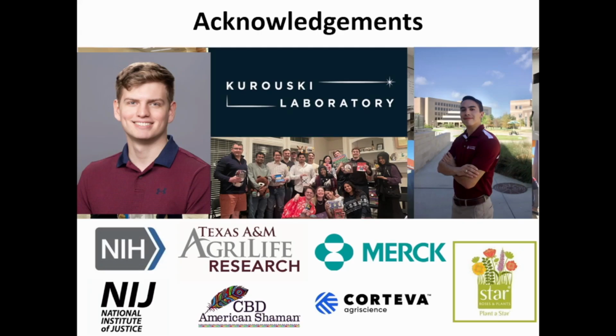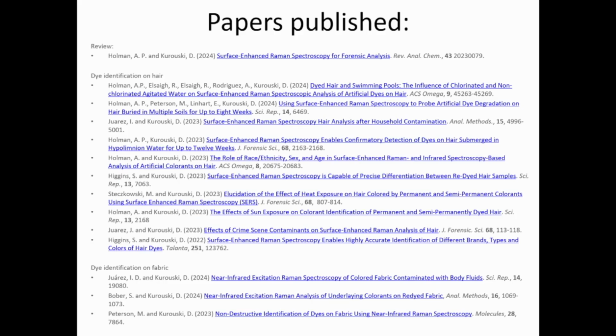With all of this, I want to thank my group and Aidan and Isaac, who performed the vast majority of work, and NIJ for the financial support. I have to say that we come to the end of the grant cycle. We published 10 papers in pretty good peer-reviewed journals that summarize the accuracy of SERS-based detection and identification of dyes in the laboratory environment, as well as in hair exposed to different environmental conditions that I just described. We, in my opinion, put a very interesting review together with Aidan.